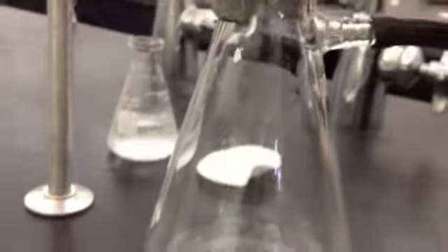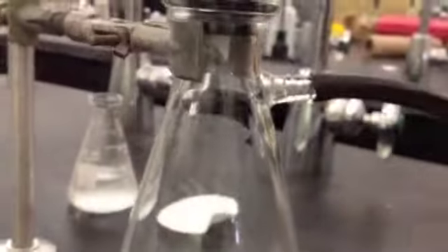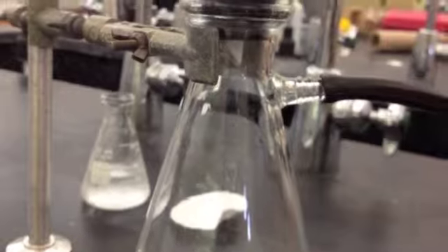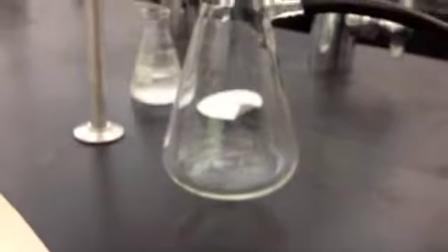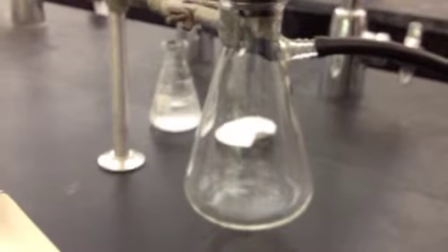As you can see, it's being drained down into the flask. Now it's important to have the solvent trap here, because when you turn off the water, some of the water backs up. And if you don't have this here and it's directly connected to the water aspirator, the water will back up into the bottom of your flask, which you don't want to happen. So it's really important to have your solvent trap clamped here in between.